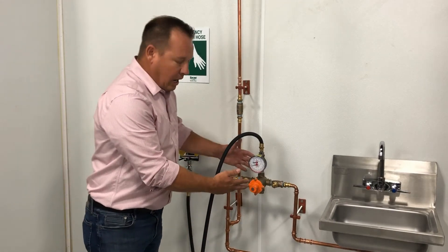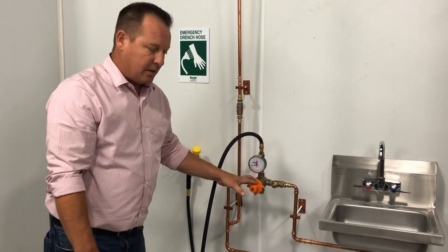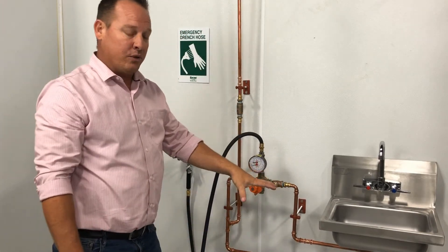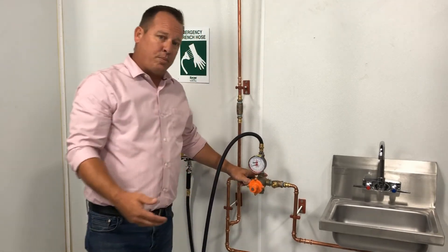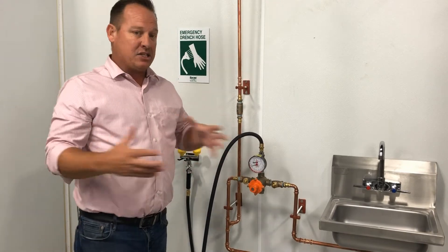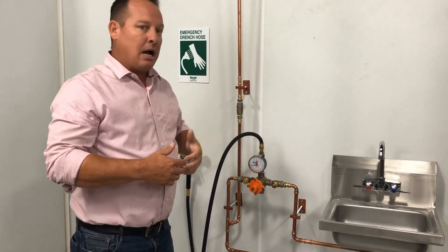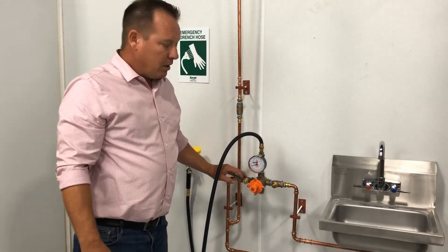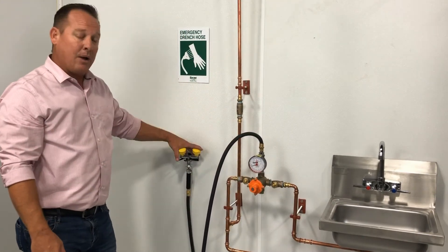My ASSE 1071 blending valve is located right here. This is not going to be mandatory — it can be lower to the floor, higher up in the ceiling, or actually located under the sink. I like to install mine in a very visible location so you're able to come in, do your preventative maintenance and rebuilding. I don't like them too low to the ground because they kind of get beat up with things rolling around and smashing into it. And I don't like it too high, just for the fact that once a year when you're getting in here maintaining and rebuilding this valve, it's tougher when you're up on a ladder. Just make sure you get it installed as close to the eyewash station as possible.